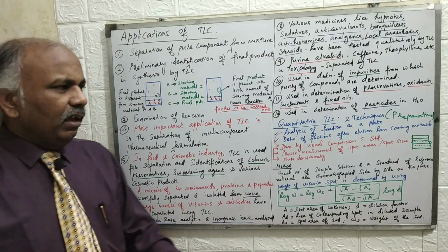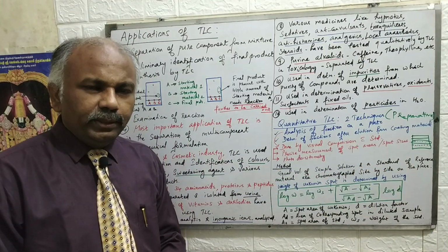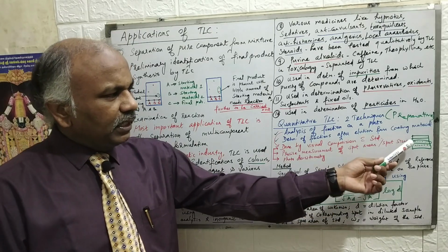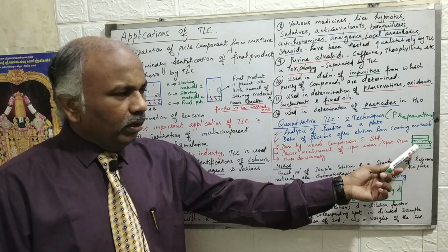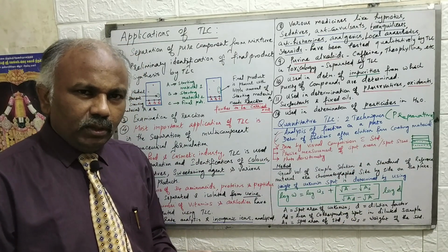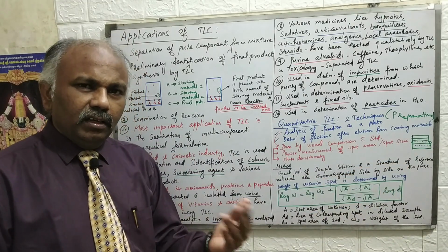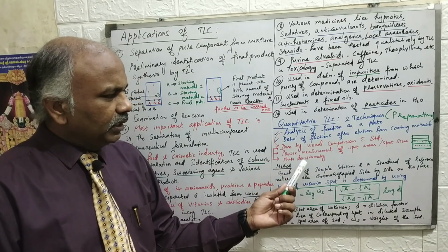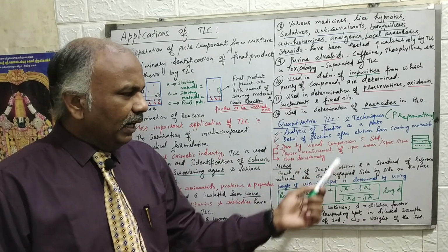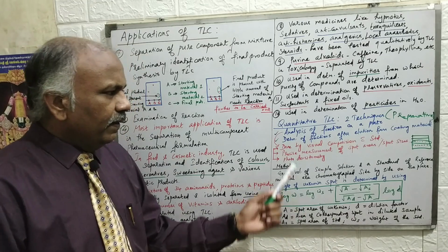So these bands contain the bulk quantity of the sample along with silica gel. You try to remove the silica gel by centrifugation and filtration using some solvents. After that you take the sample only out. If any solvents are there, you try to remove them using a rotary vacuum evaporator, and then you can analyze it either by optical densitometry or some other methods. Photodensitometry we can use, or visual comparison with the standard, or precise measurement of the spot areas or the spot sizes, right?